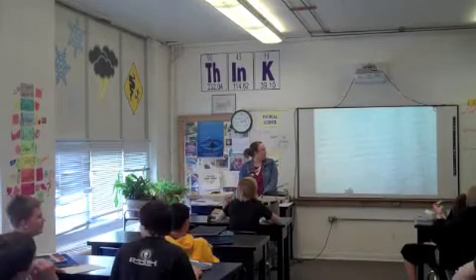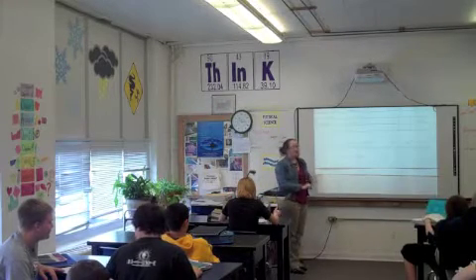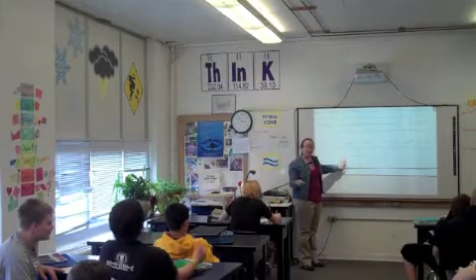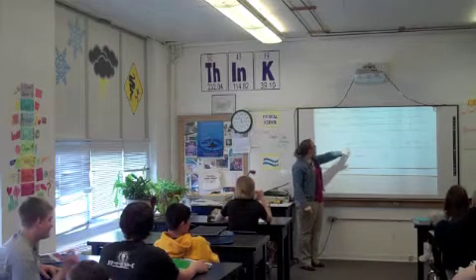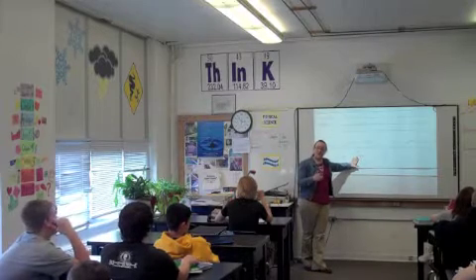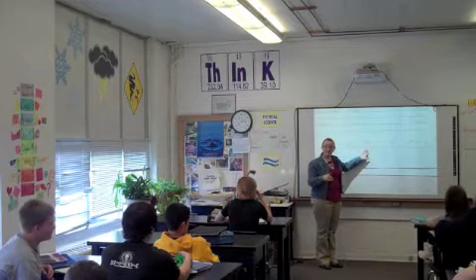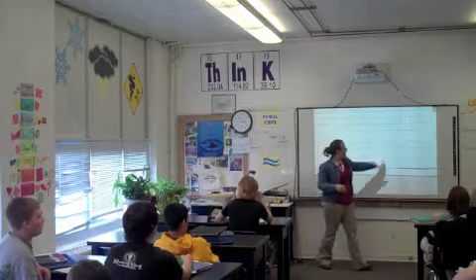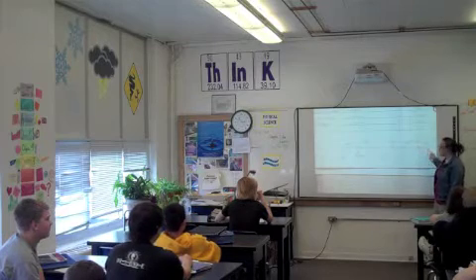Okay, so we picked a few chemicals to use today. We have vinegar that you guys said was a pH of 3. Using the pH paper, you found the pH because we had the color change chart to look at. Aspirin you said was a 4. There's some shampoo that 6th Hour had that Travis Huntington brought that was a 5, and some chai tea that Tiffany brought that's a pH of 6. I have distilled water that's at a 7. Baking soda dissolved in water was slightly basic, so was Lysol, Windex, Tide, and drain cleaner.